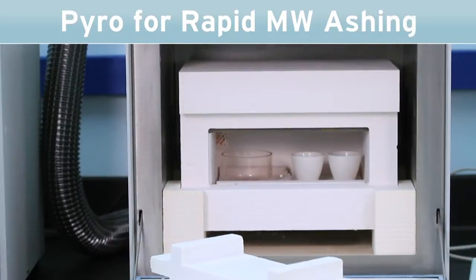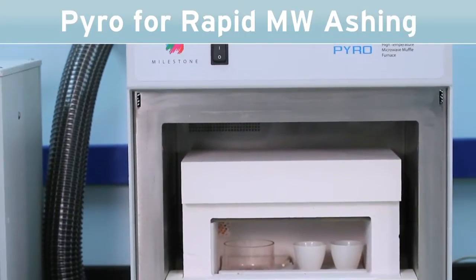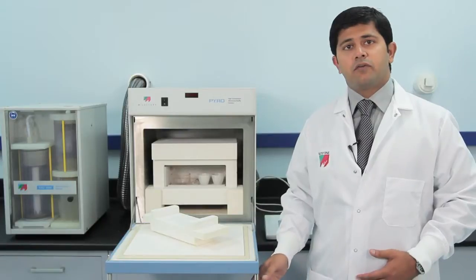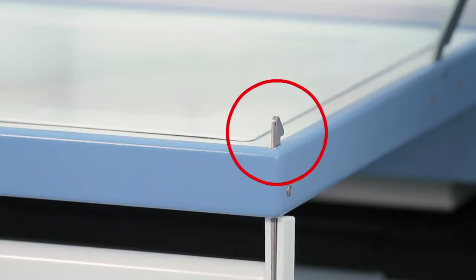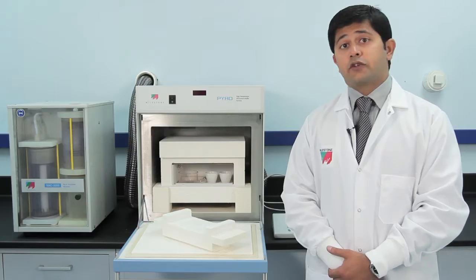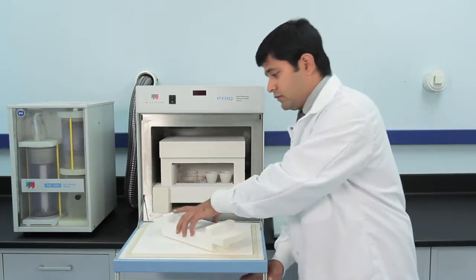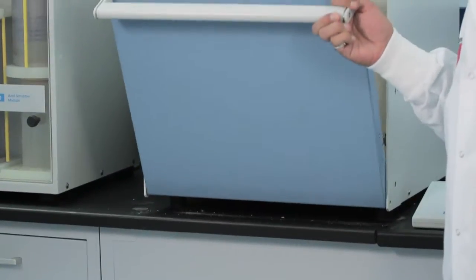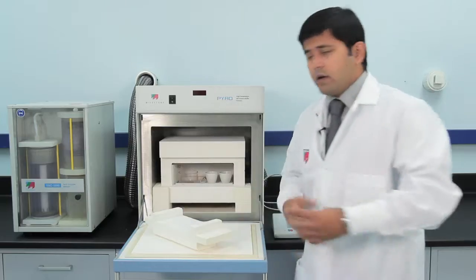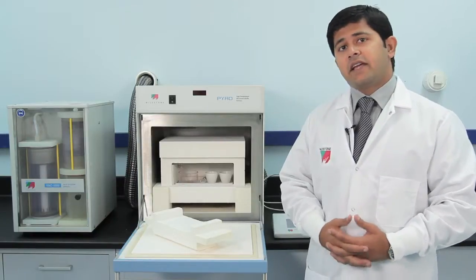The Pyro is the only microwave ashing system in the market that features a stainless steel cavity and a stainless steel door, which is fully interlocked and locked in place with two stainless steel latches into the cavity. The door opens and closes like so, providing a convenient heatproof platform for loading and unloading of the samples.